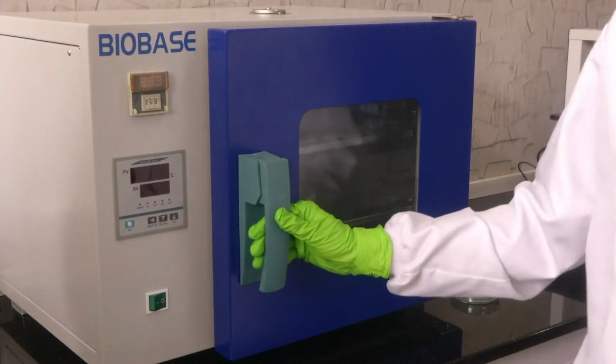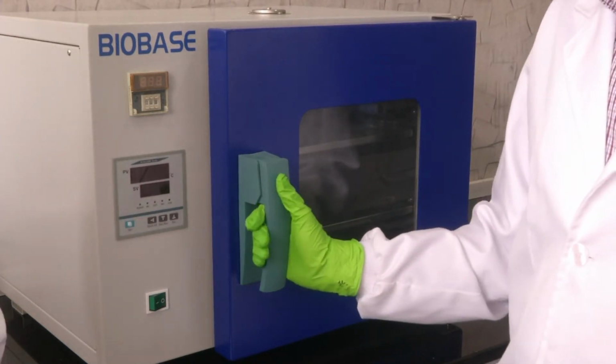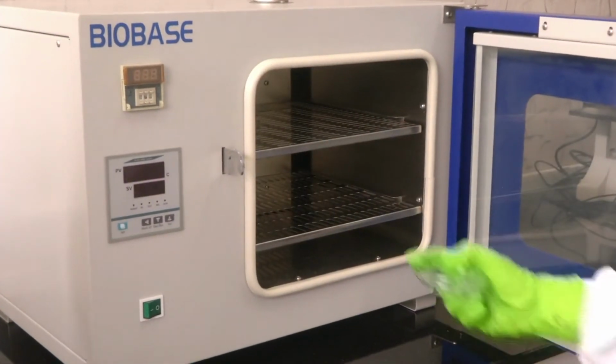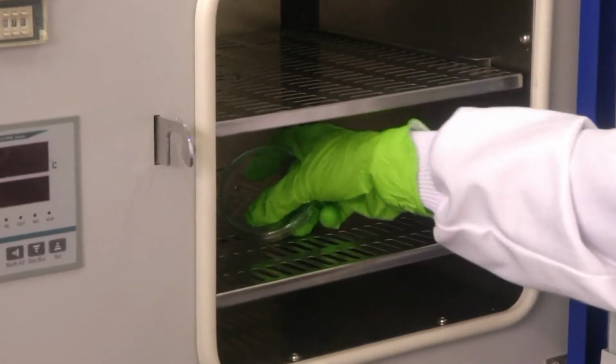Now we think that the inside temperature is manageable. It has come down to a normal temperature. Now Suman will open the cage door. He will insert a sample which he wants to heat. See that the sample is put inside. Suman, can you show the sample inside?